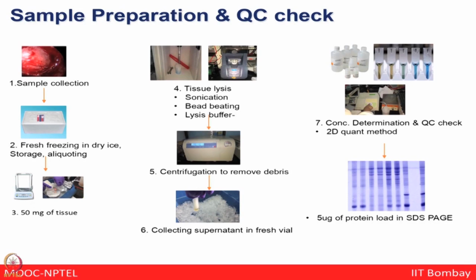So, collecting samples of biological biospecimens is not easy, especially it requires ethics approval to start a given study from the clinical samples, and then you need to work under supervision of these clinicians and pathologists to obtain the right sample types. Immediately they have to be flash frozen and stored in the right condition, and then immediately you have to do the protein extraction to take your proteome analysis forward. So, a lot happens at the sample collection and the sample processing level.